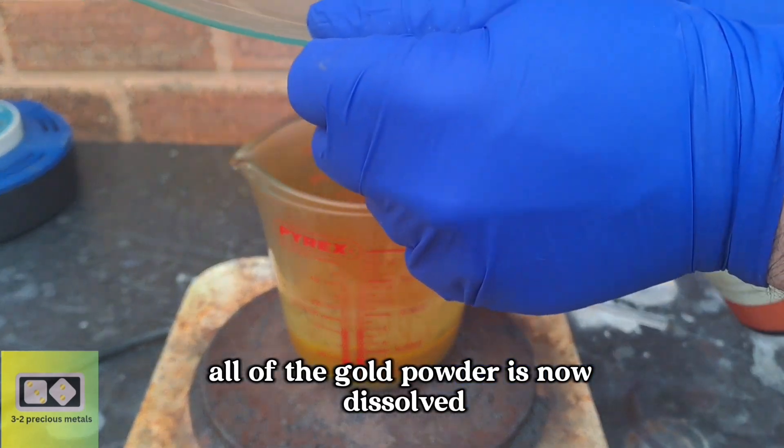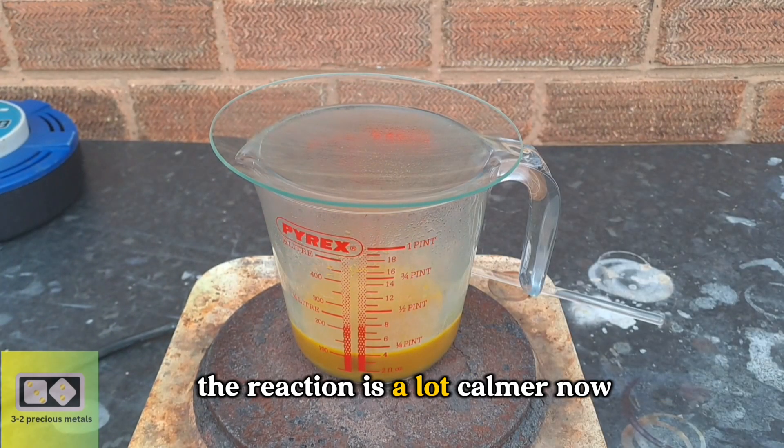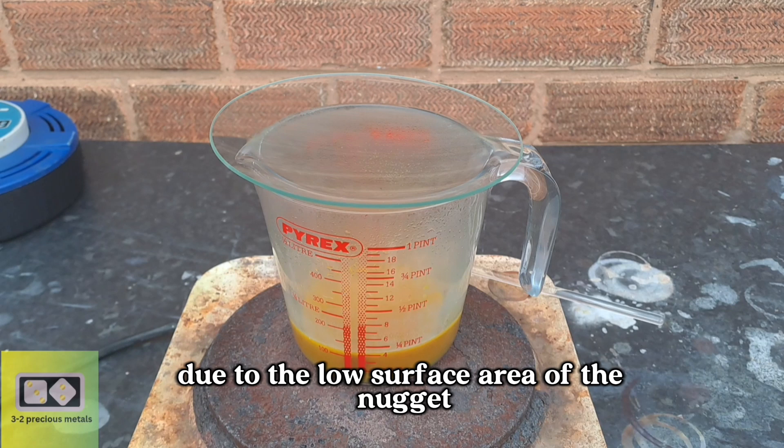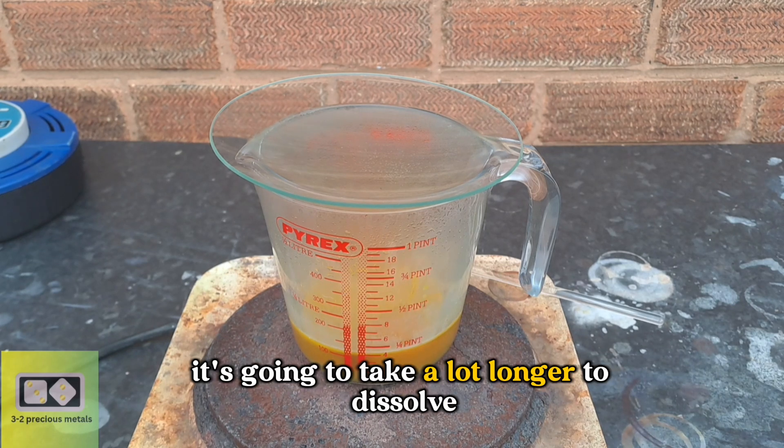All of the gold powder is now dissolved, and all that's left is the small nugget. The reaction is a lot calmer now due to the low surface area of the nugget. This also means it's going to take a lot longer to dissolve.